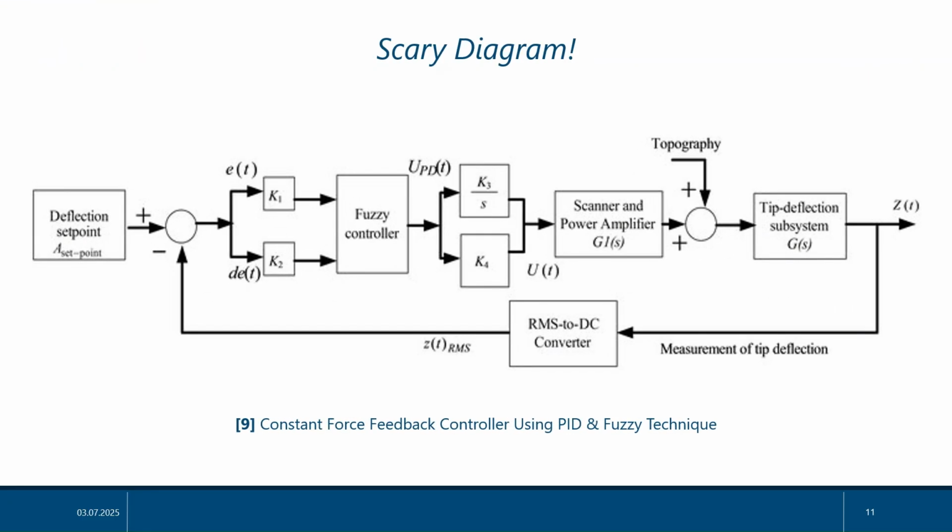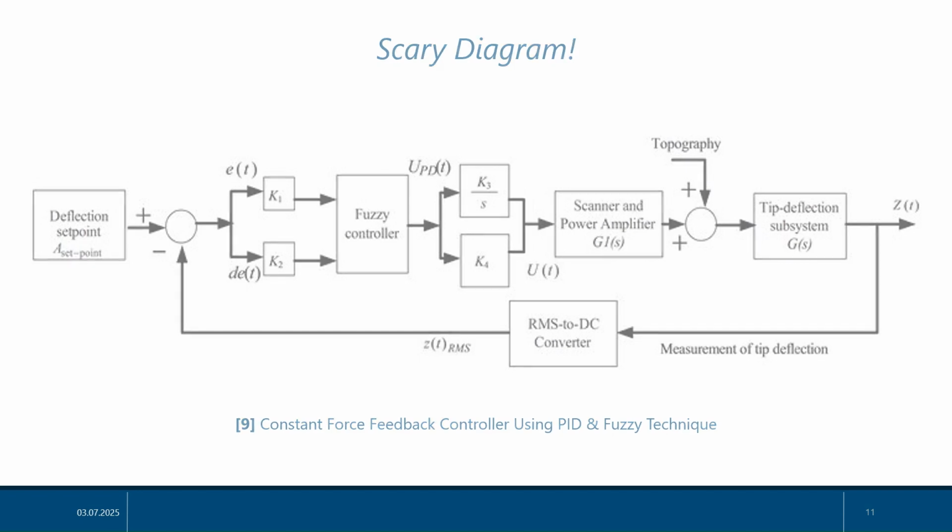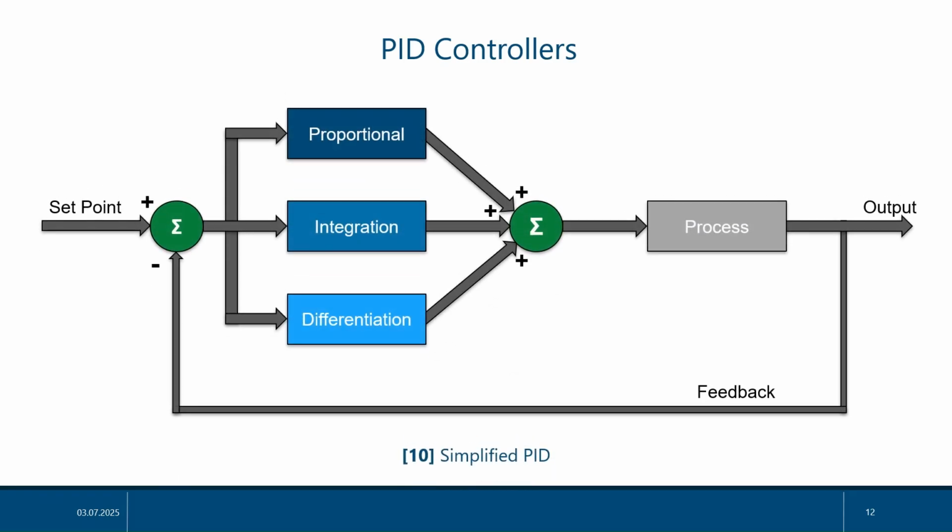Generally, when we think of control systems, we think of something scary, like this block diagram. But for now, we can simplify that. This block diagram, which is based off of a PID control system, is a little bit friendlier to start with.